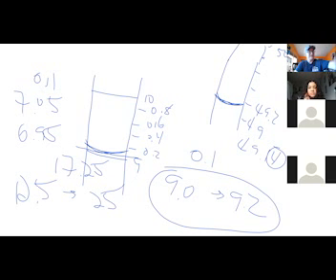That's because this is a crappy way to measure volume, and that is the whole point. It's not that you can't, shame on you, you can't measure volume in a flask. Well, nobody can because they're not supposed to. So if you're way off, not a problem. That's the point of the exercise.